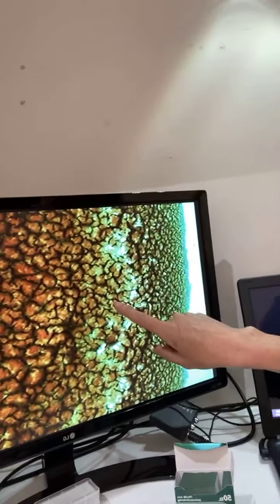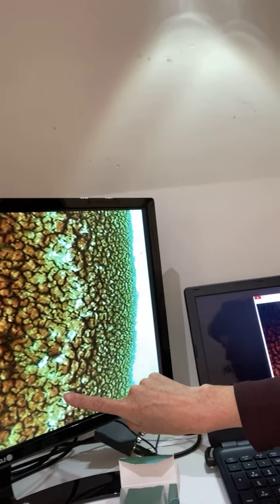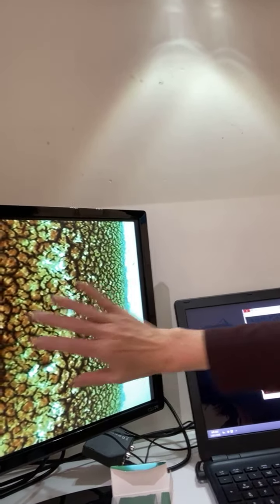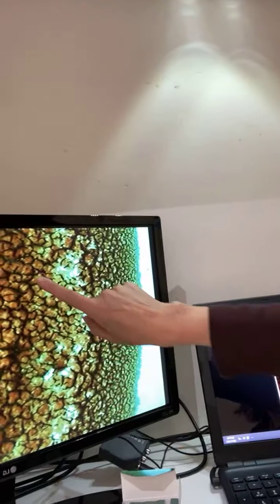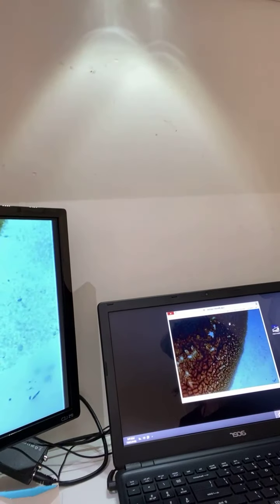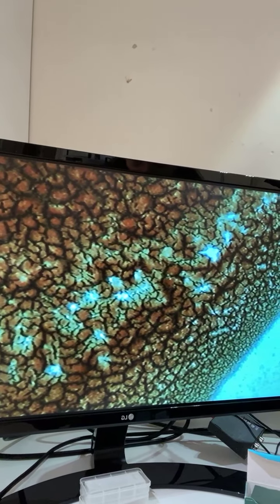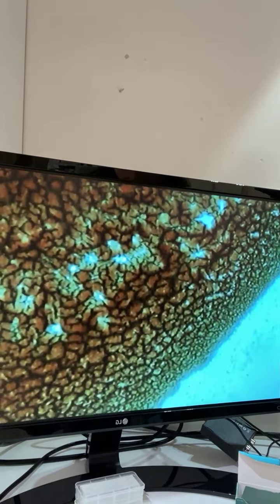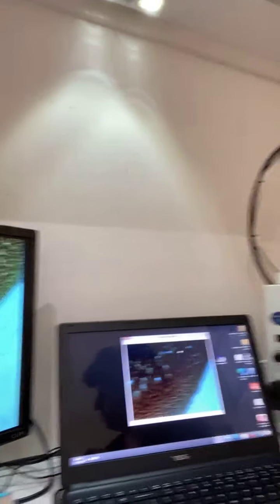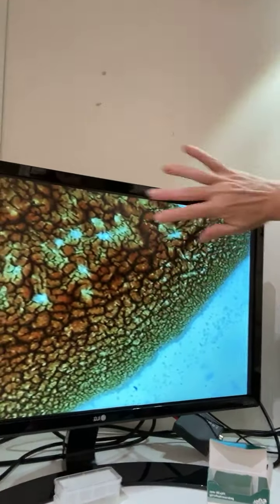This is just a look at your biological terrain — the territory or map that is your body. This is a blood sample. You can see here what we call ROS — that's oxidated blood cells. You can see some paler colouring here as opposed to redness over here, and some darker areas. As we travel around the spot you'll see some bigger white oxidated areas. I'll point out to you: this is ring one, ring two, ring three, ring four, and so on.